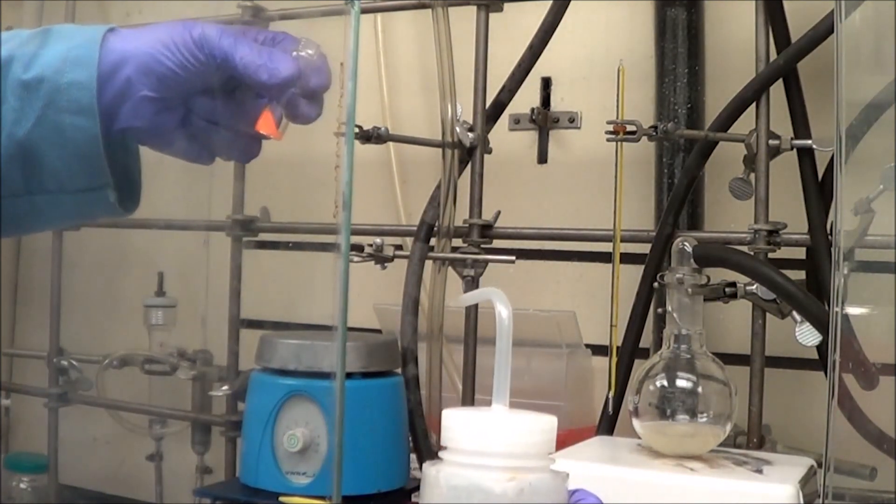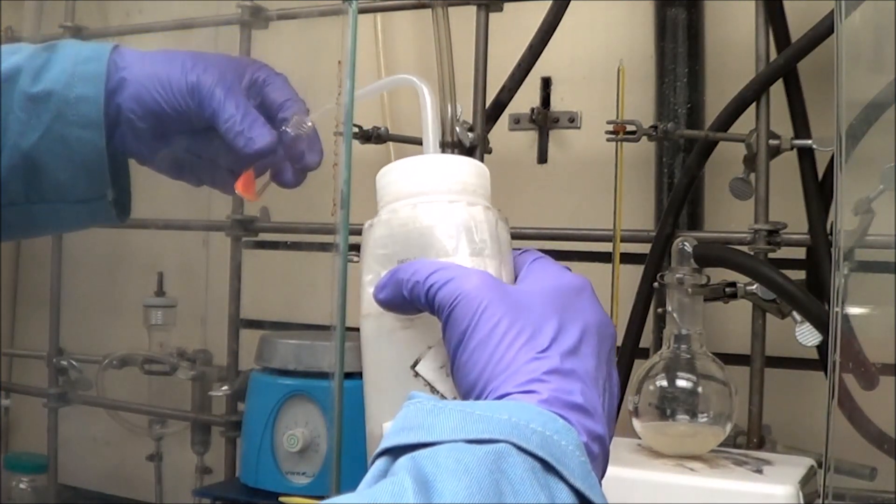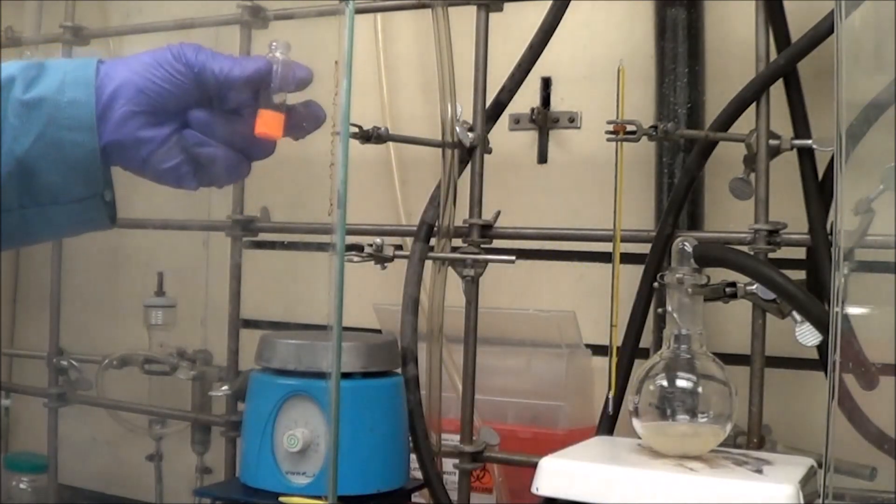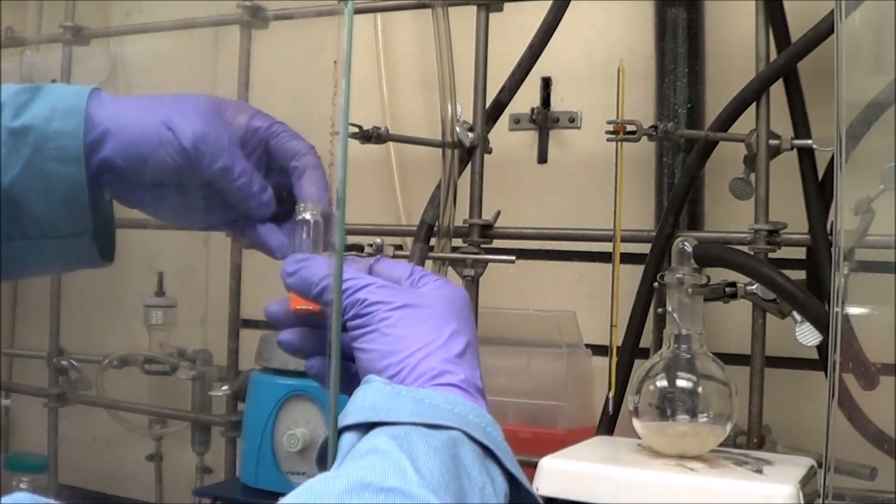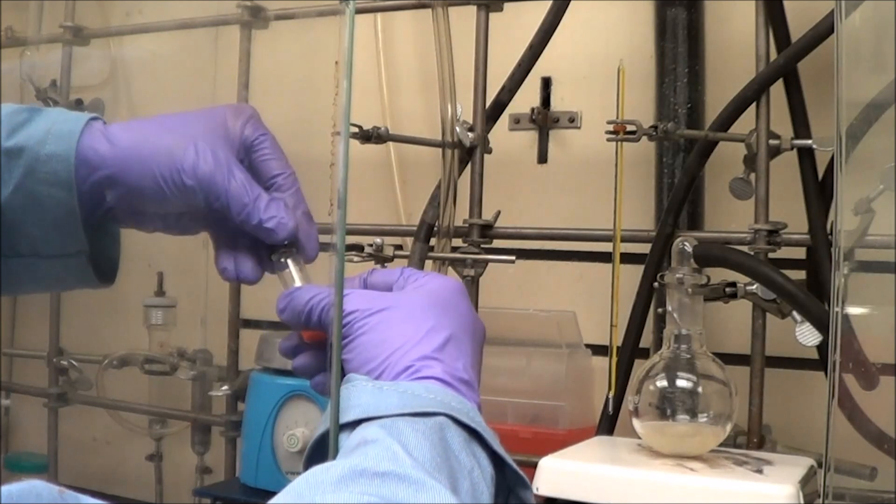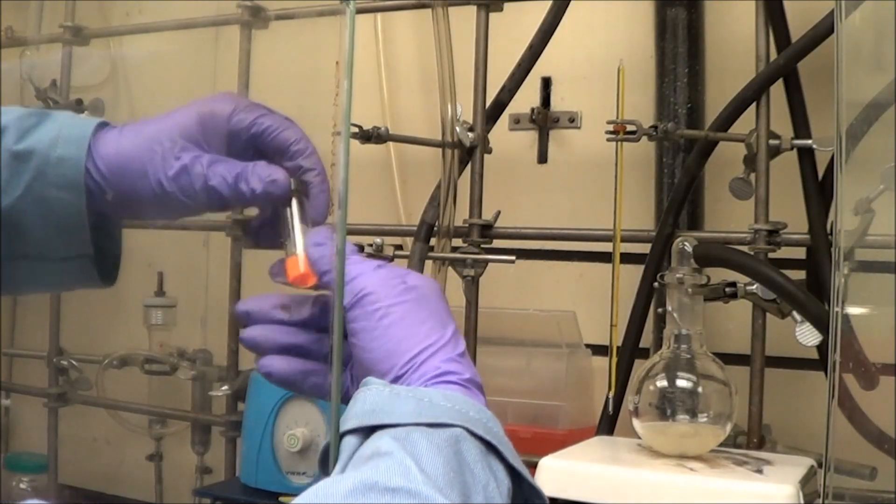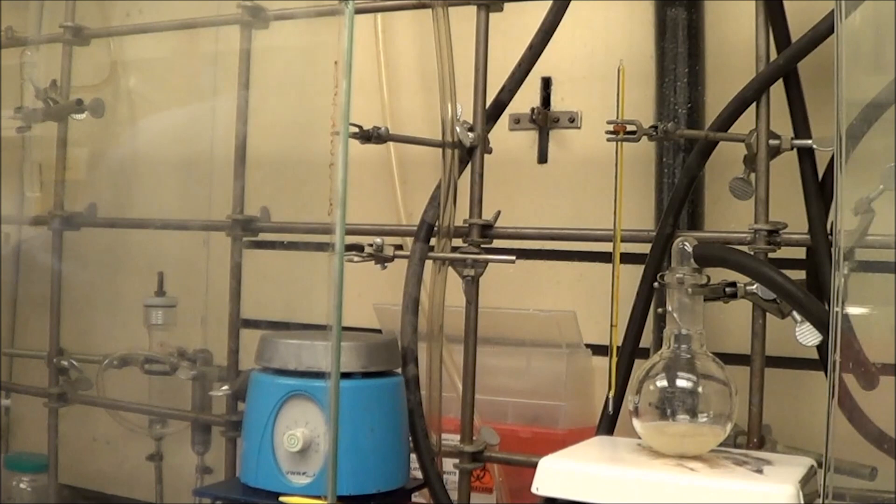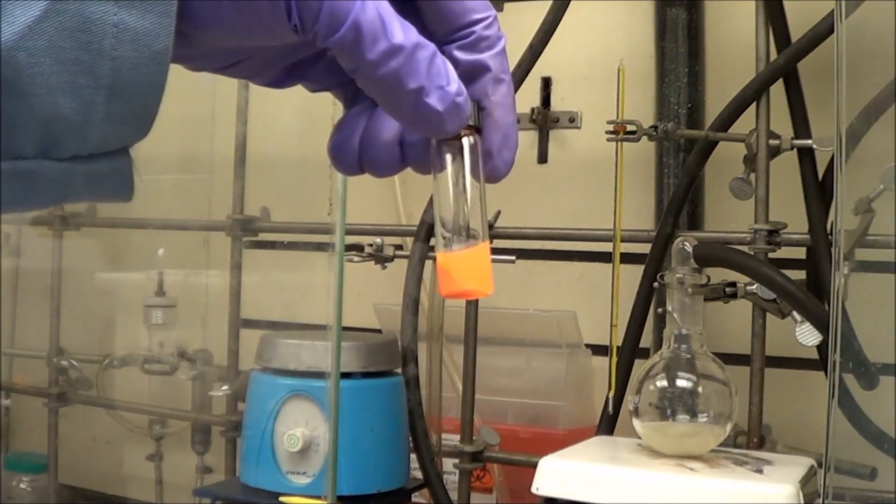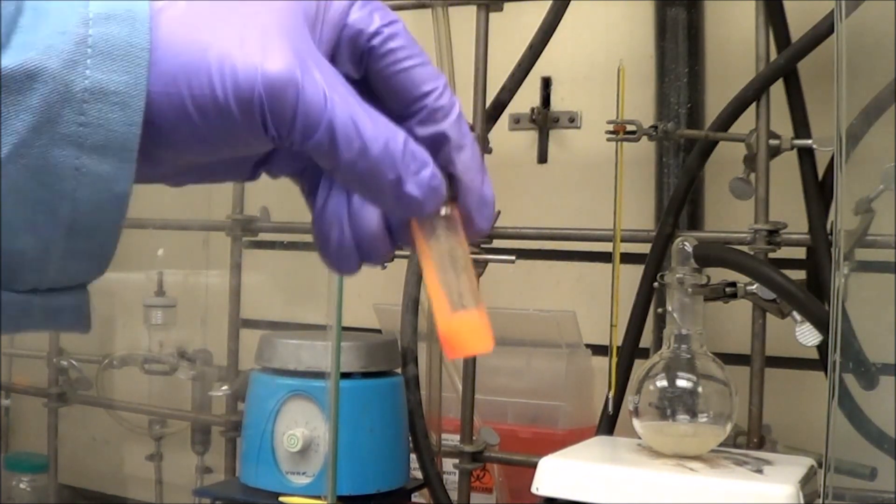Now to do so, I first remove the supernatant, and then I'm going to add some hexane, not too much, just about two mils, and then I'm going to break up that paste, and sometimes I have to use a lot of force to do so. I'm going to break up the paste so the hexane can extract the QDs from that paste.